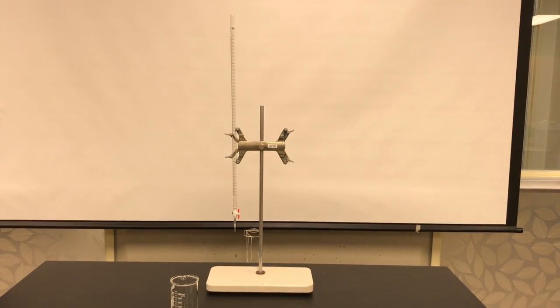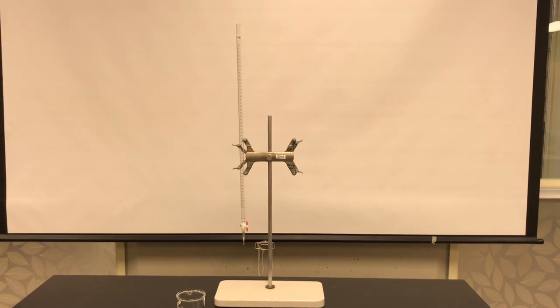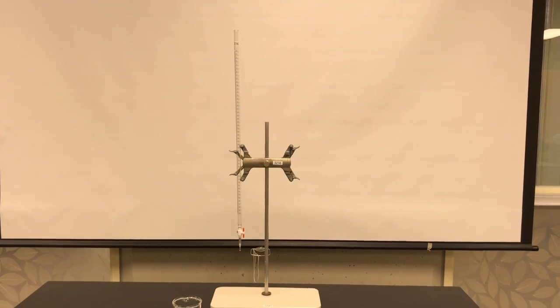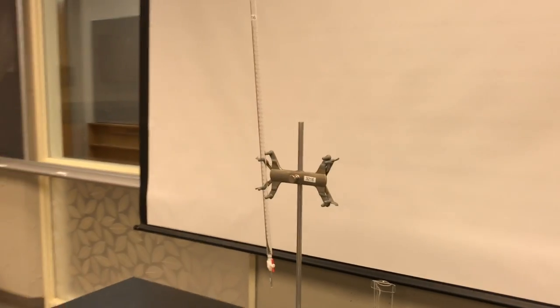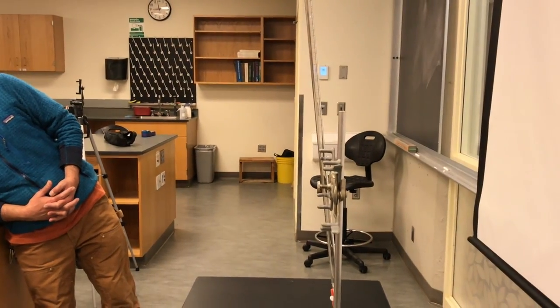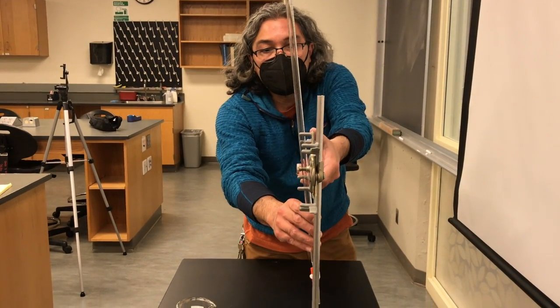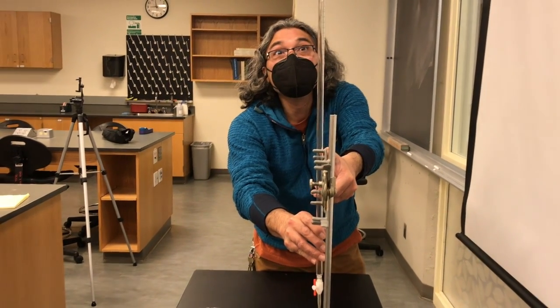You need to confirm that the burette is level. Sometimes it's hard to see that if you're looking at the burette when you're in front of it. So it's best to actually move over to the side and check whether or not the burette is level. If it's not level, what you want to do is loosen the clamp springs and adjust the burette till it looks level to you.